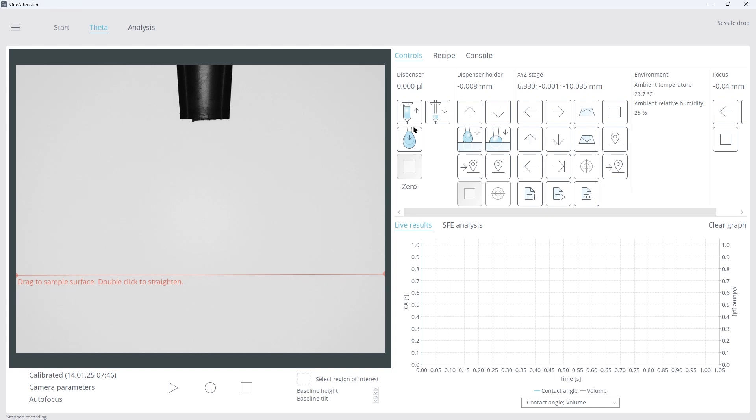For this measurement, we will be using the arrow icons to control the stage's movement, and the pipette icons to control the pipette. Click once to start, and click again to stop.